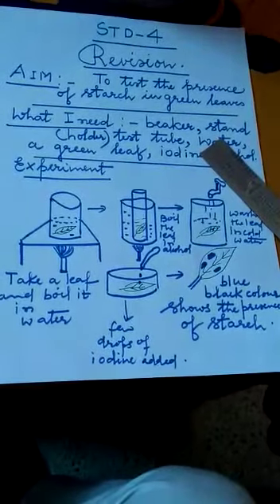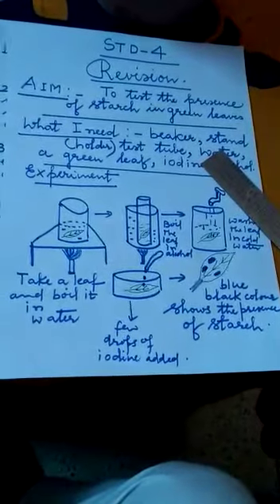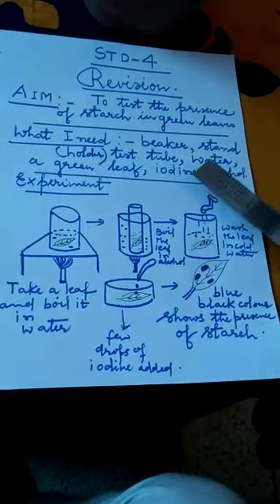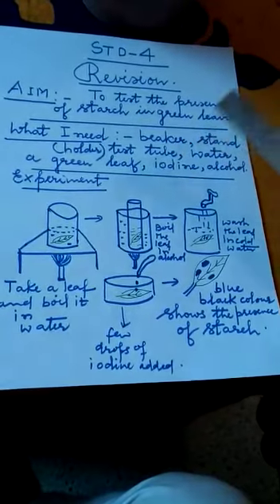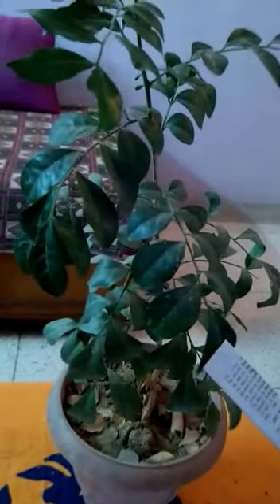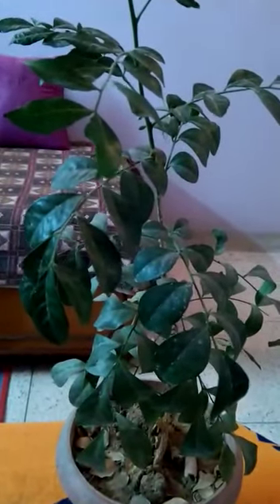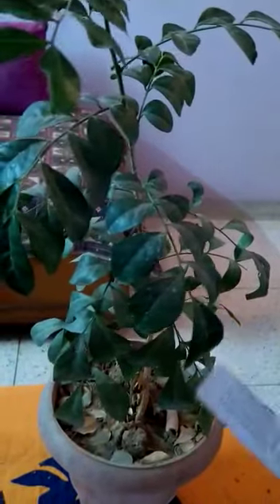Now, after having all the idea of what things are required for photosynthesis, let us have some tests. When we test the leaf of a plant, how can we come to the conclusion that this leaf has starch in it, and that the plant has photosynthesized and prepared food, which is stored in the form of starch in this leaf?